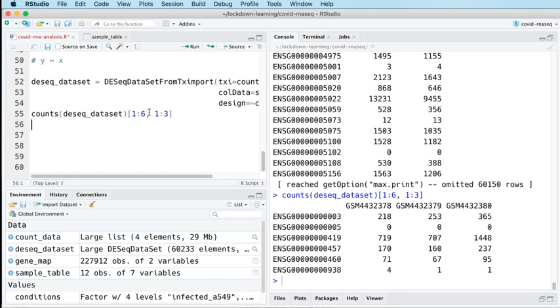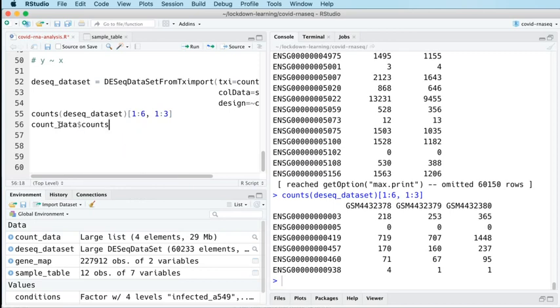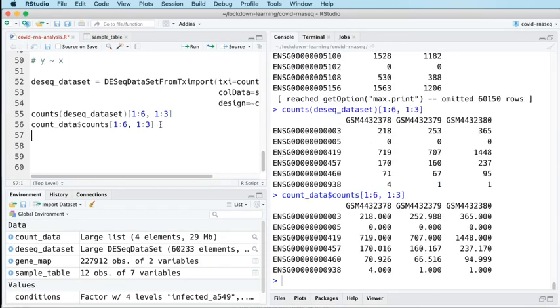And then if we look back at the count table yesterday, what did we call it? Count data. The counts in the count data, which is what DESeq has imported. If we look at that data, the first line here is the data in the DESeq dataset, and that's what you can see in the console here. The second line is the tximport data that was the result of doing that yesterday. And hopefully you can see that the data in DESeq and the tximport data are subtly different. That's because when you import data into DESeq, it rounds it for you, to the nearest integer. There are reasonable reasons for that. DESeq expects to work with integer data, with count data, which it expects to be integers.